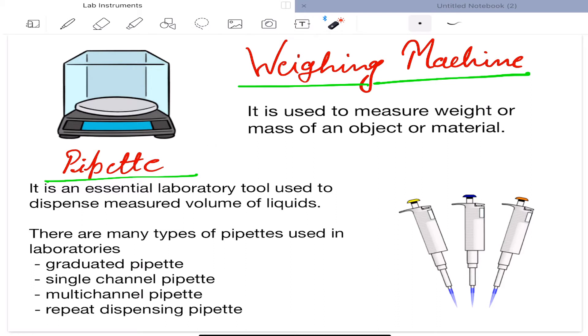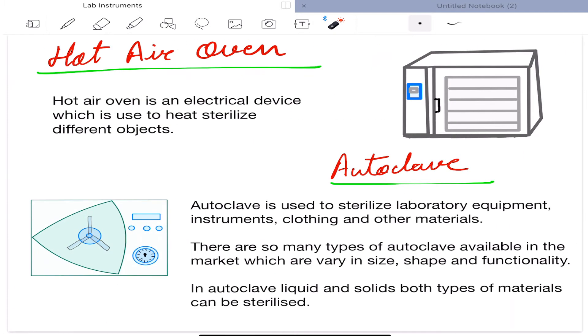It is used to measure weight or mass of an object or material. Next is pipette. It is an essential laboratory tool used to dispense measured volume of liquid. There are many types of pipettes used in laboratories: graduated pipette, single channel pipette, multi-channel pipette, and repeat dispensing pipette. Next is hot air oven.